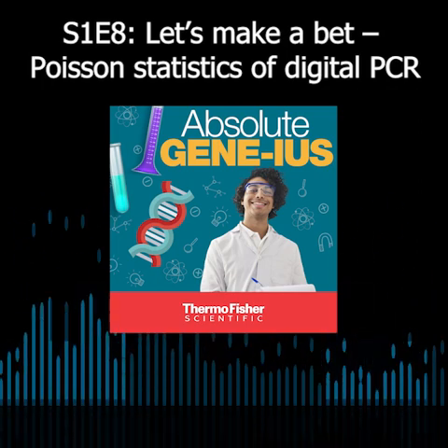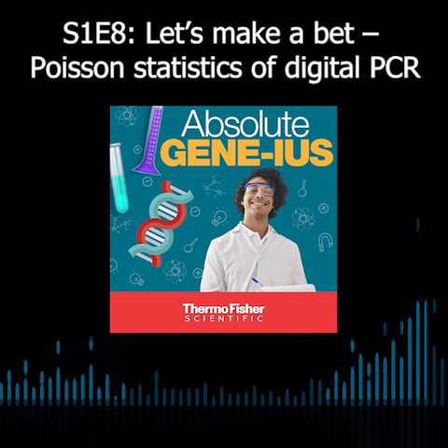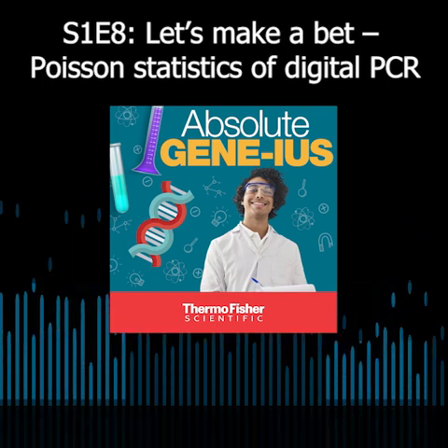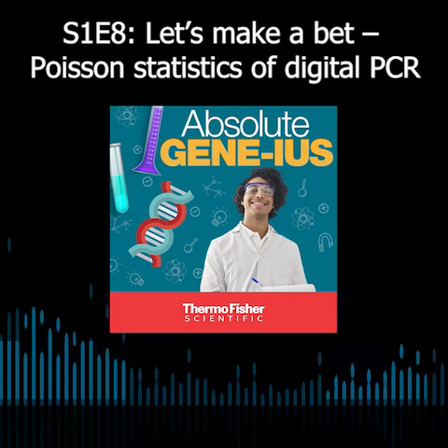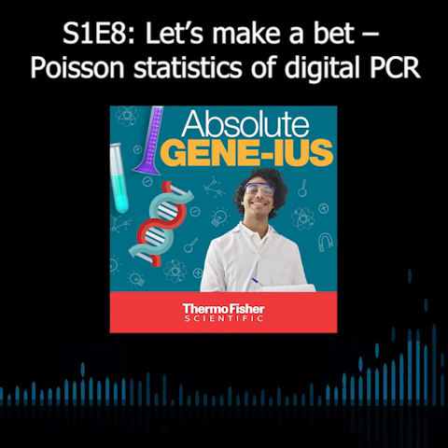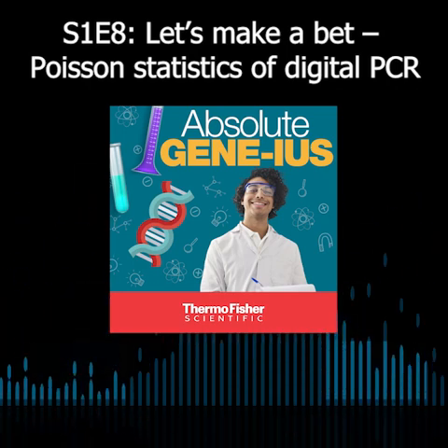I always got to compare digital PCR to real-time PCR. If you're used to real-time PCR, you know you have your reaction mixture. It's got your sample, your DNA that you want to target in there. And there's usually more than one copy. Maybe there's 5,000 copies. But with real-time PCR, you take all 5,000 copies, you just put them in the reaction volume, and then you get a value out of that.